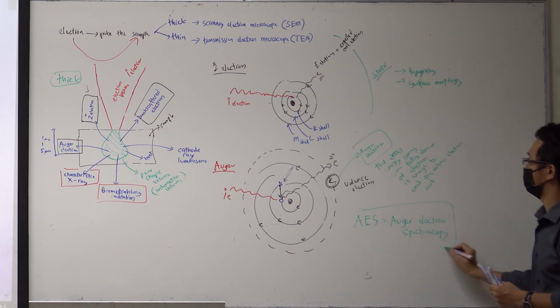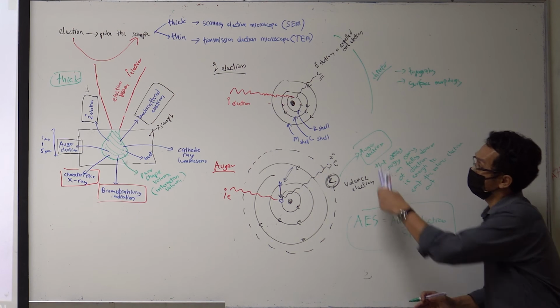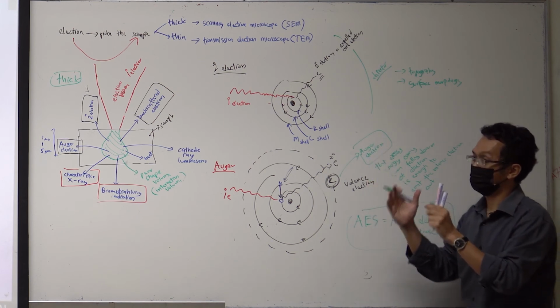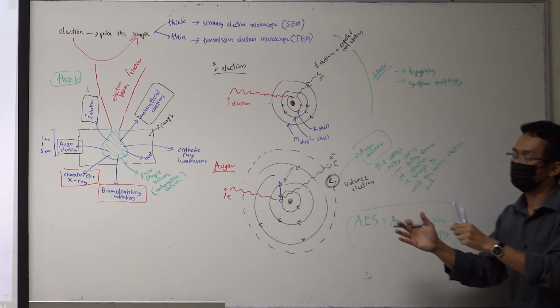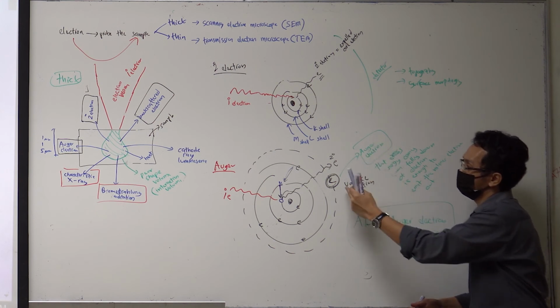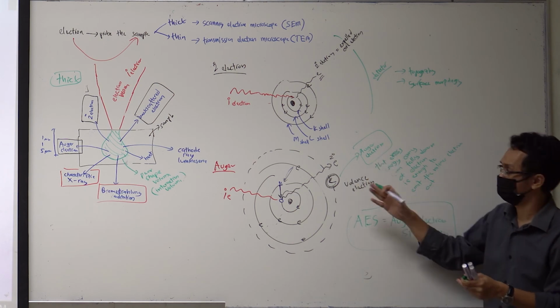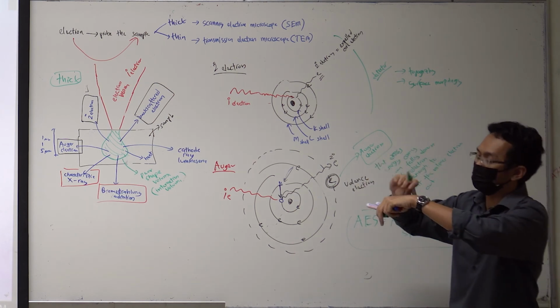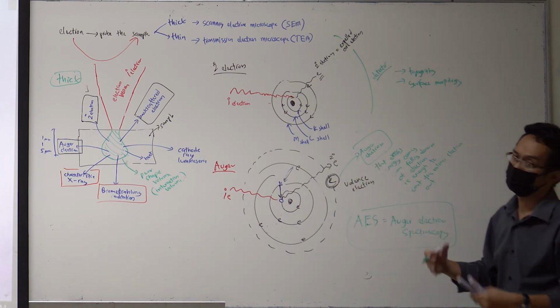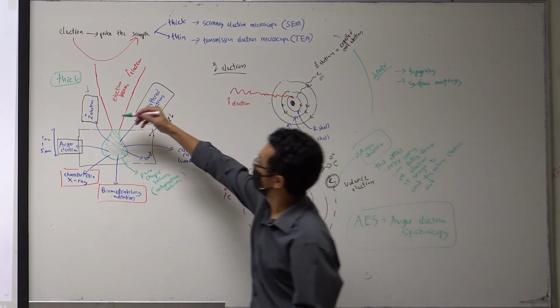Okay, so you have this other tool, but we don't discuss it. Just to let you know that this Auger electron is specific to a specific material. So different materials have different Auger electrons. People study the surface using Auger electrons because at the surface, the outermost electrons are valence electrons. So people do surface analysis using AES. So that's the Auger electron. We're done with the Auger.